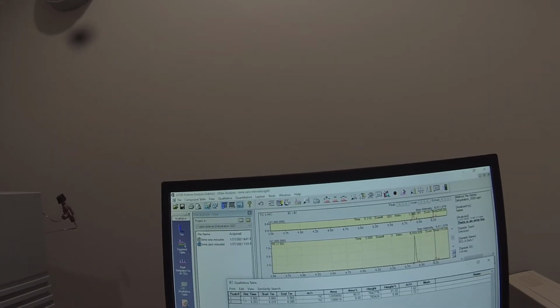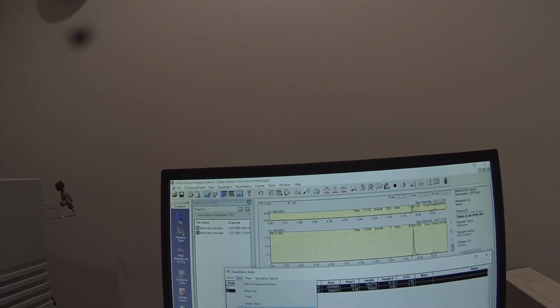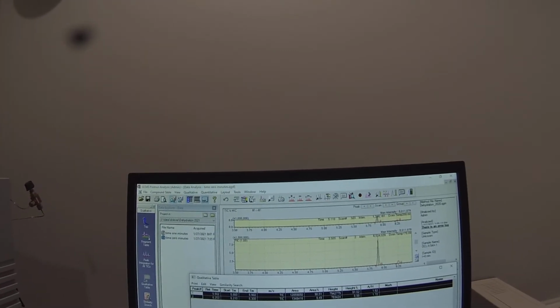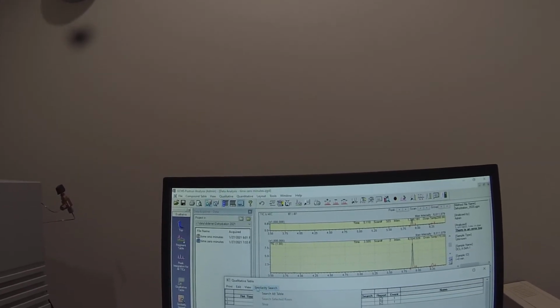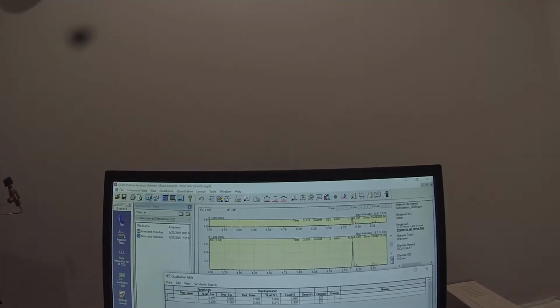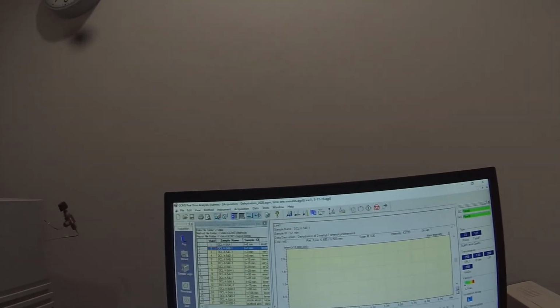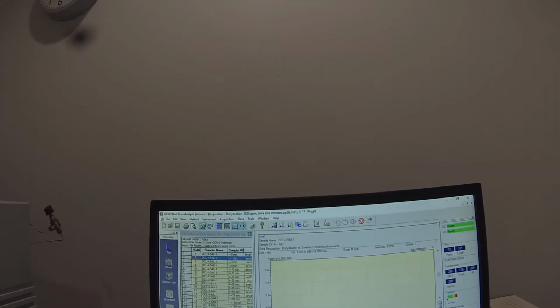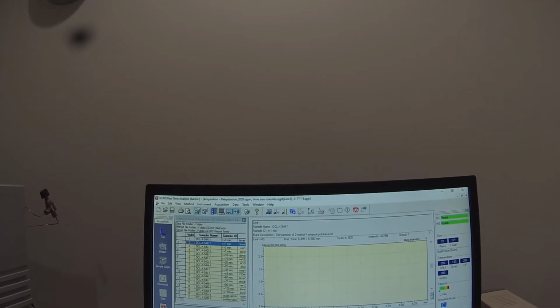If I want to, I can select those 2, and under the edit menu I can register those to the spectrum process table. And then I can go to the spectrum process table, and under similarity search I can search the table. I'm not sure if those compounds are actually in that table or not. It's getting ready to inject the sample, so it just took me back to the real-time analysis.